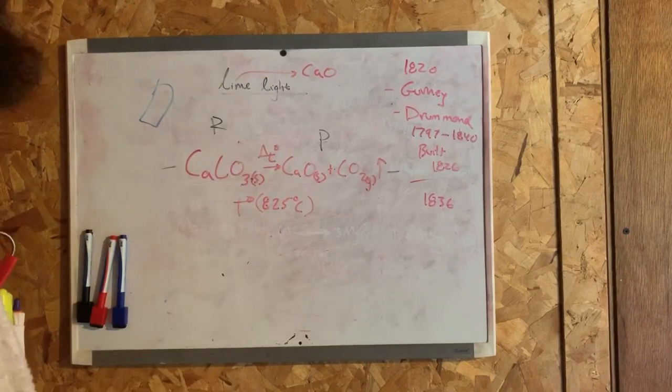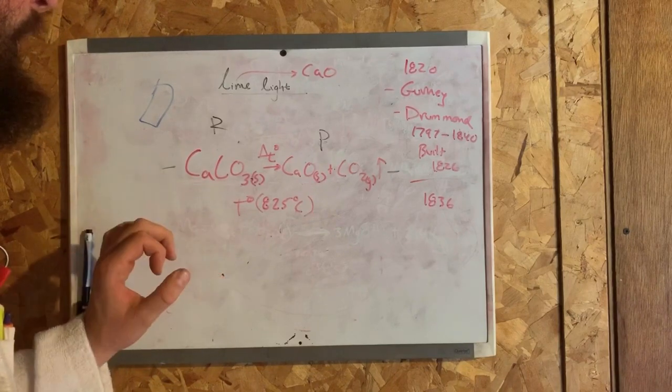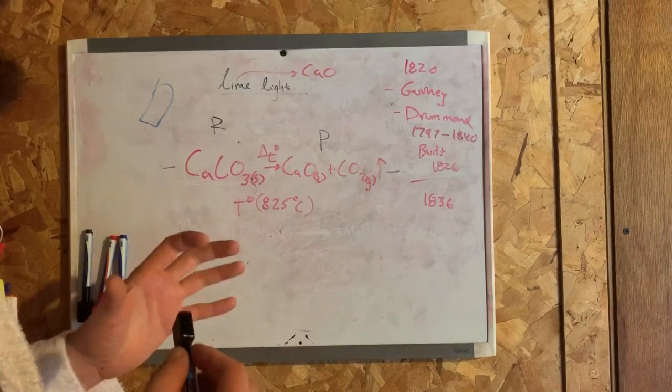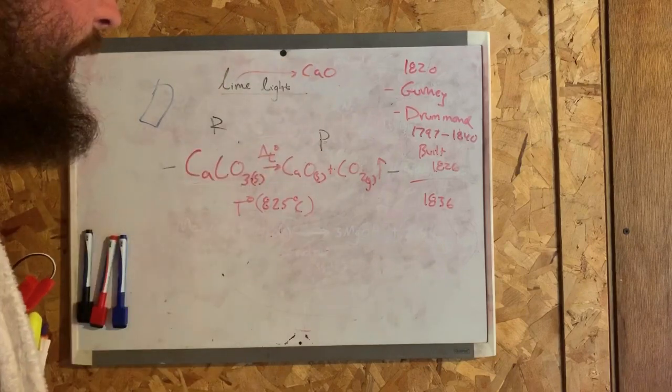The reagent is calcium carbonate, which is a piece of chalk that I have. In essence, I'm going to take chalk and convert it into lime, which is calcium oxide.